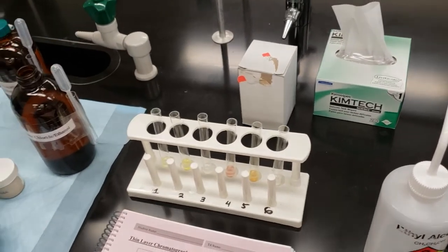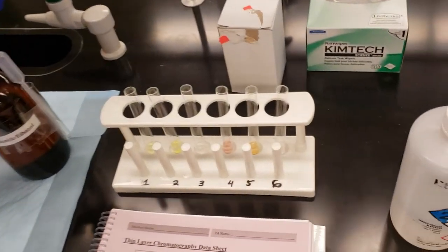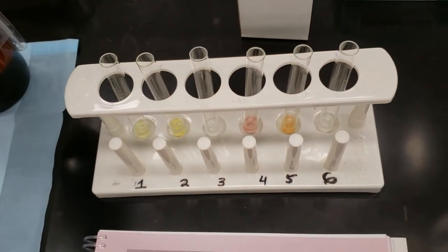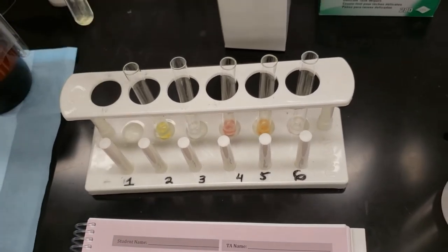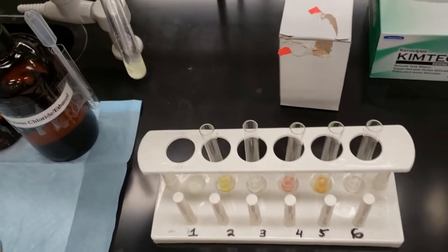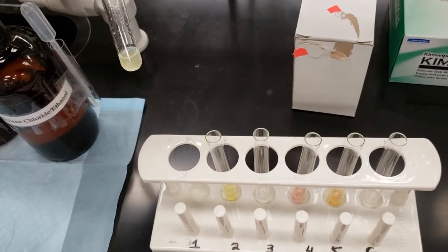All right, so let's take a look real quick. I'm going to give these a swirl. We can take a look at these different solutions. Okay, so we've got some excess powder. Not everything's going to dissolve.